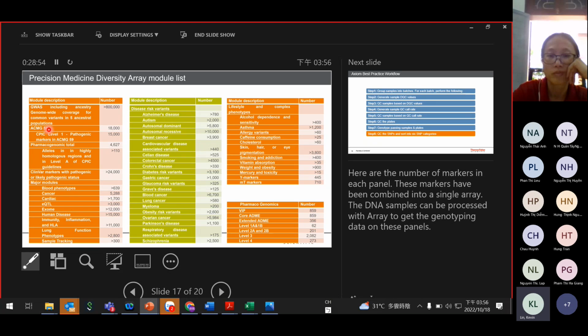So most of the time we just use one or two, but for VIP markers we can replicate as many as possible. From my experience, we can have 32 repeats at maximum. We repeat this probe around, maximum 32 replicates.